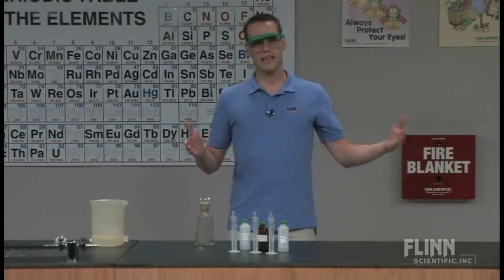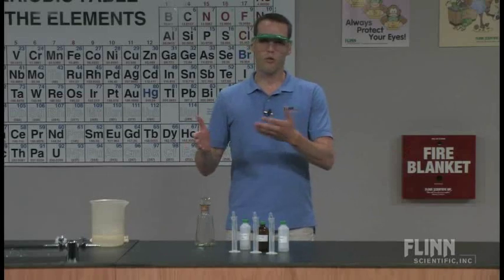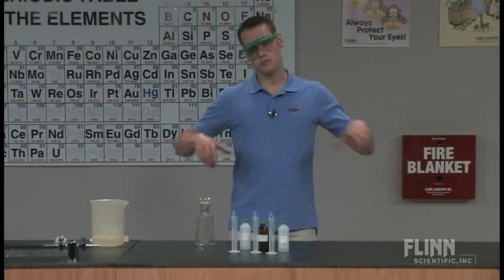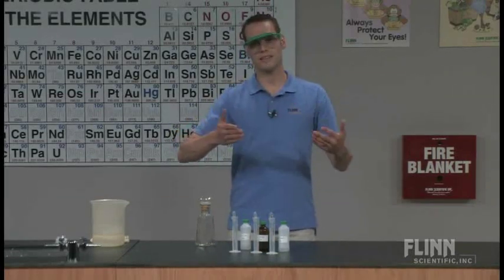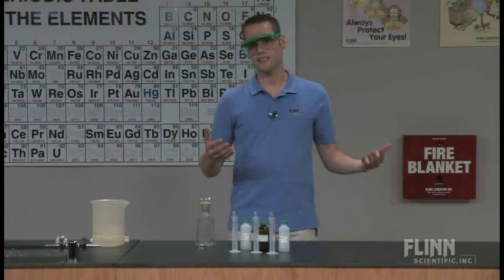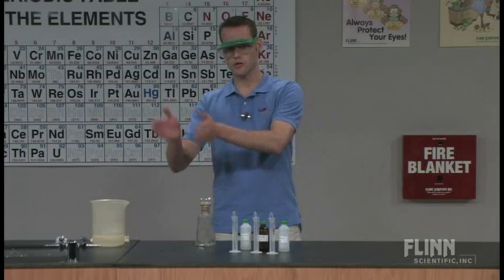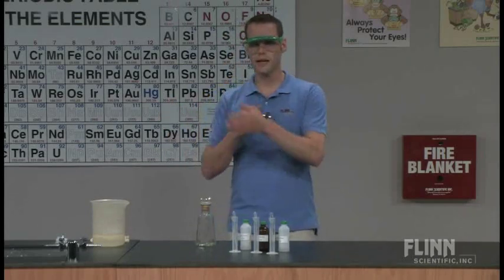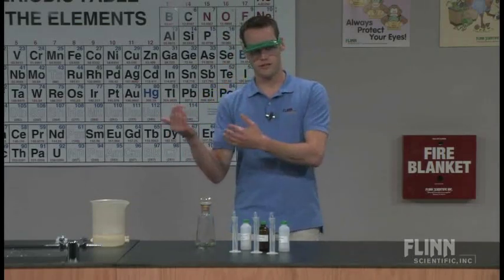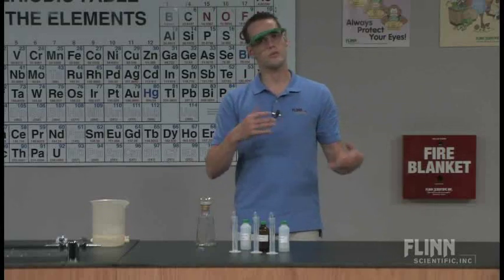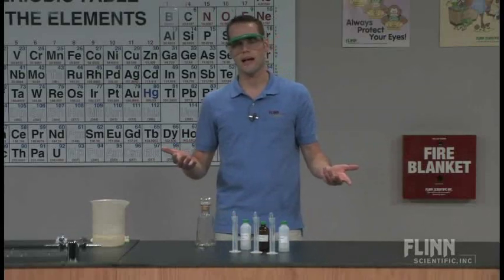I treat this as sort of an assembly line process so I have four long lab tables, or two long lab tables, two sides each for a total of four aisles that I set up in my classroom when I have my students do this. And I have solution A, solution B, and solution C. They go from one station to the other down the line and they silver their bottles. It's a really efficient process and doesn't take much class time at all.